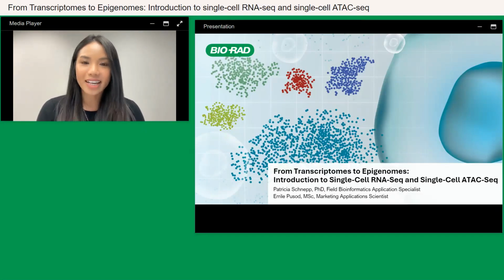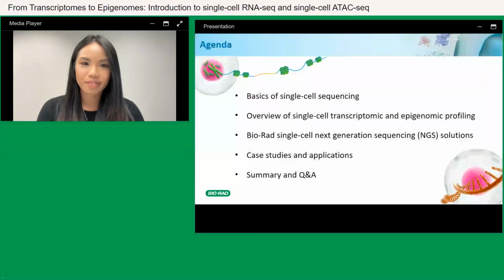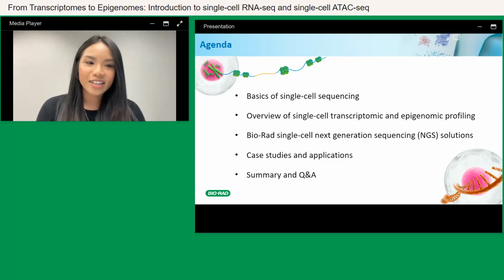Again, my name is Errile, and today's webinar is the first in our series of educational webinars on single-cell sequencing. In this webinar, we will be discussing the basics of single-cell sequencing, specifically giving you an overview of transcriptomic and epigenomic profiling. Next, we will introduce the Bio-Rad single-cell next-generation sequencing solutions, our library preparation kits, and show you some interesting data on case studies and applications. Finally, we'll leave some time at the end to answer some of your questions.